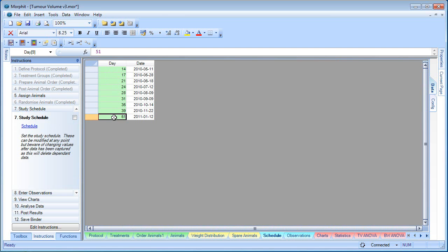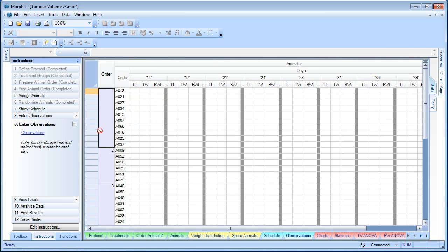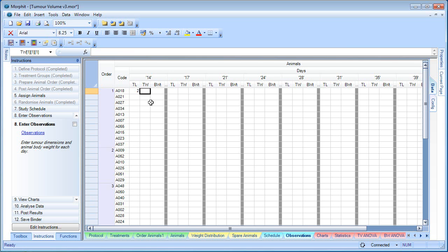This can be done at any point during the experiment. So we may have just started off with day 14, and every time we make an observation, simply add the date. This binder has been designed for manual data input. So the scientists will measure the tumour and enter the body weight. That's for every animal and every observation day.